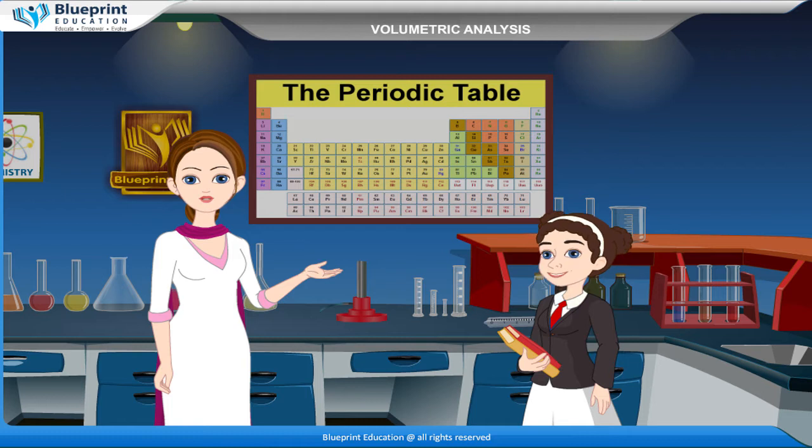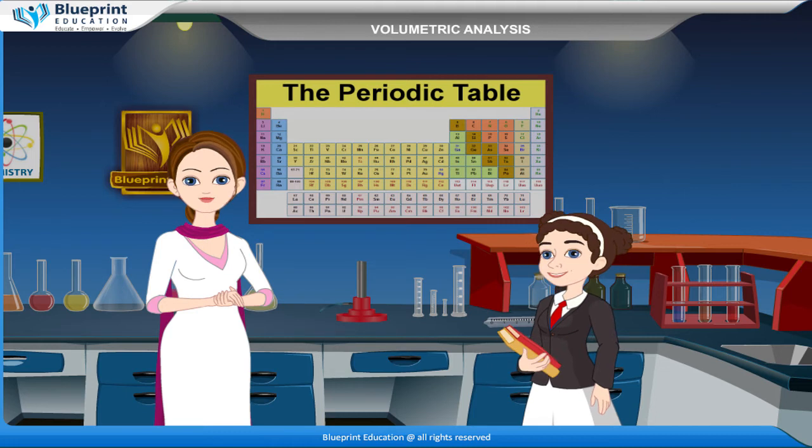Let's do an experiment to prepare 250 ml of M by 30 oxalic acid solution. Using M by 30 oxalic acid solution as a standard solution, find the molarity and strength of the given sodium hydroxide solution.